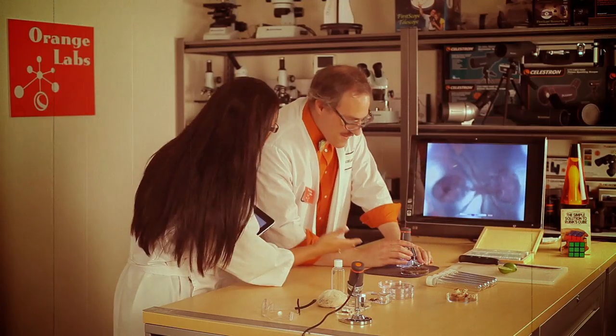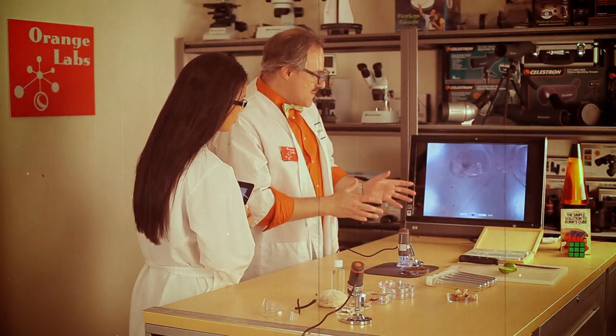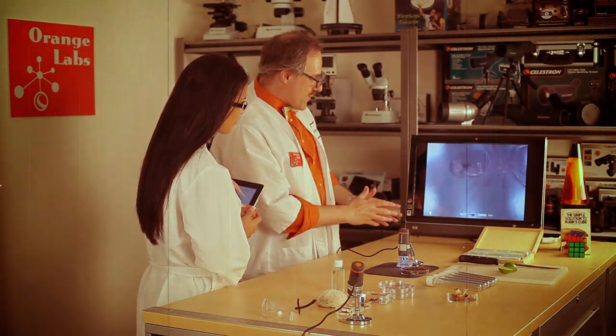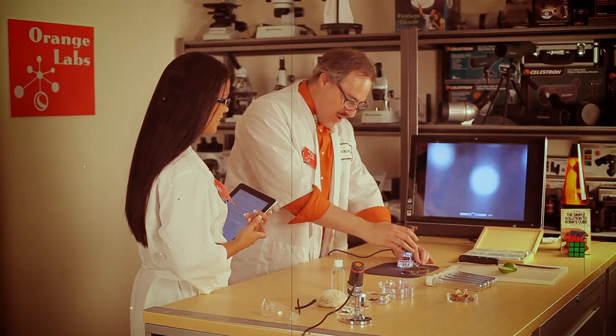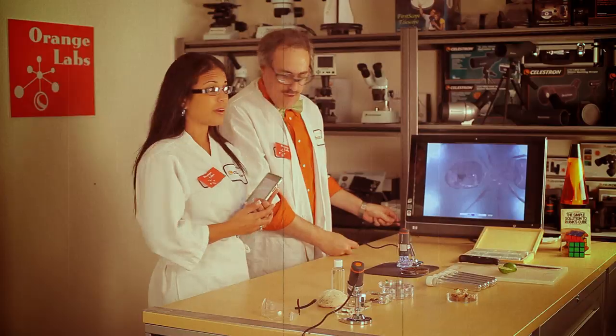Why don't you just tell them about the microscope? This amazing gizmo plugs directly into your computer and allows you to view all kinds of things right on the screen. It's got a great stand that allows me to position it in all kinds of different ways. It's connected via USB connector.